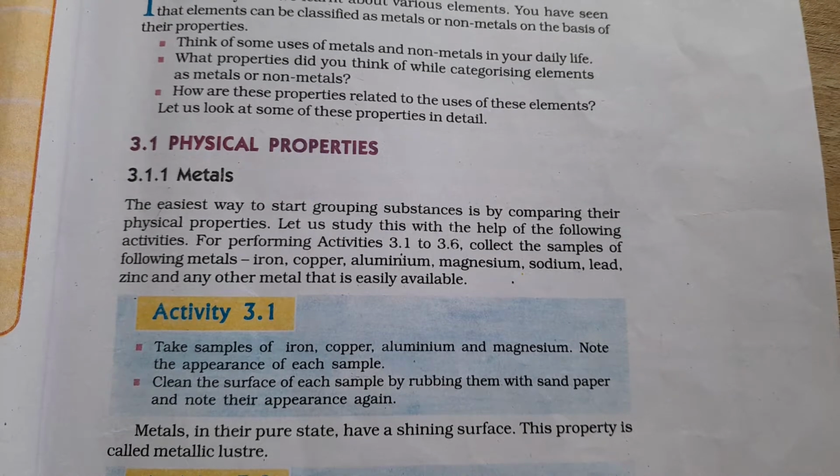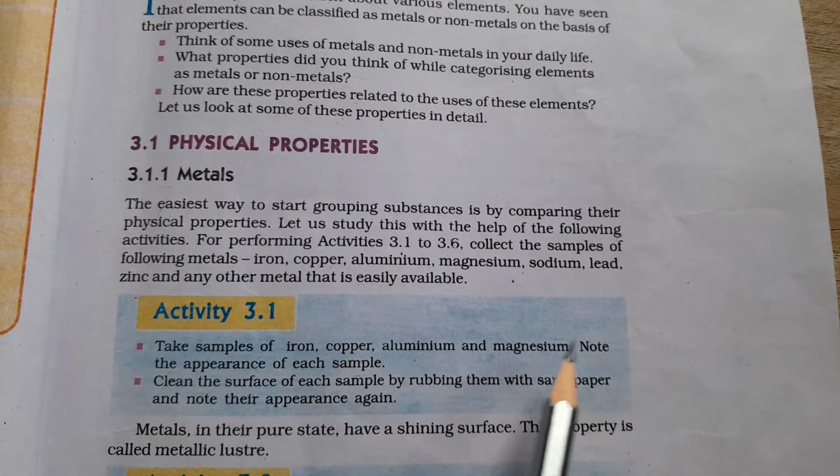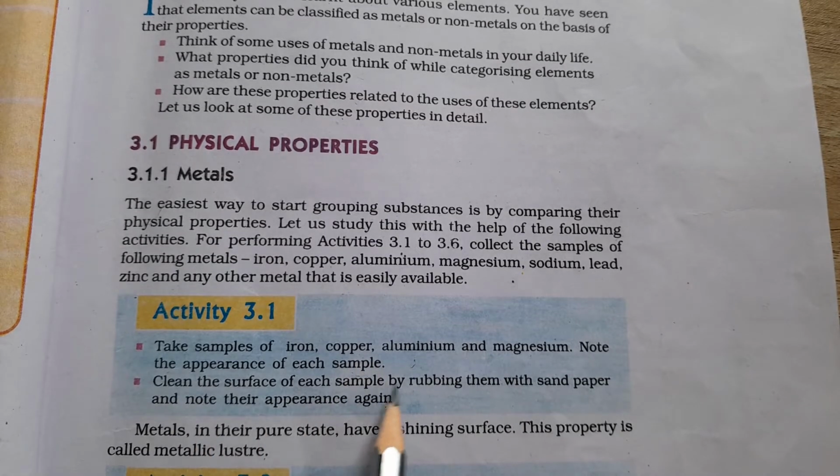Hi dear, today we'll see activity 3.1 to 3.8. Okay, so what is the first activity? Take samples of iron, copper, aluminum and magnesium. Note the appearance of each sample. Then clean the surface of each sample by rubbing them with the sandpaper and note their appearance.